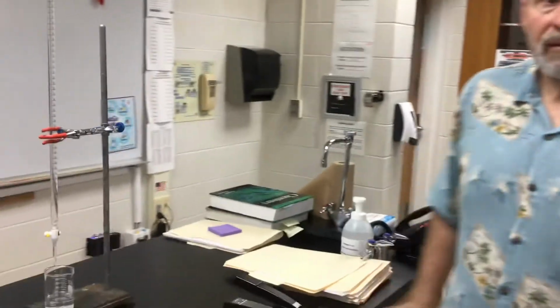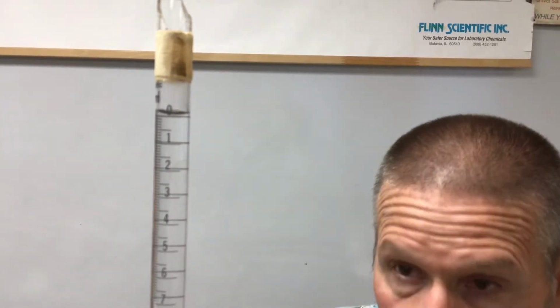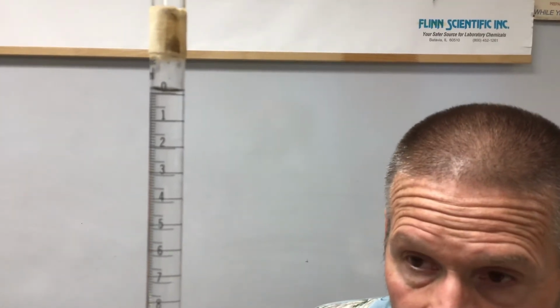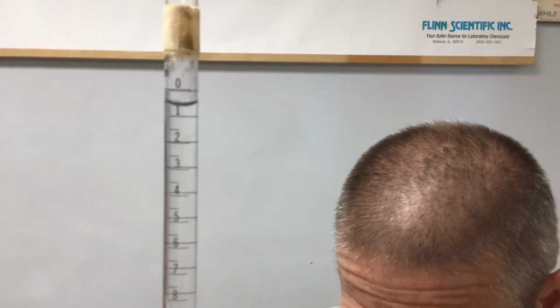So we're only going to drain it once, so we have to go back with the video and get the time. Hopefully you can, with your phone, look at the video and time it and pick off the times going down the Buret. Okay, so I'll keep the camera on the volume, and we'll tell Mr. Hevel when you're ready. You will open up that valve, and away it'll go, and we'll just keep this on. Whenever you're ready, go ahead and start draining. Okay, here we go. So just open.